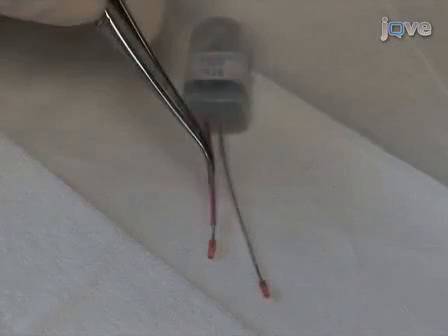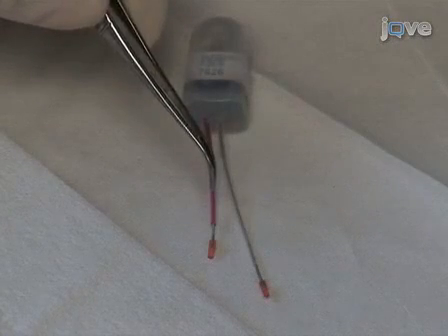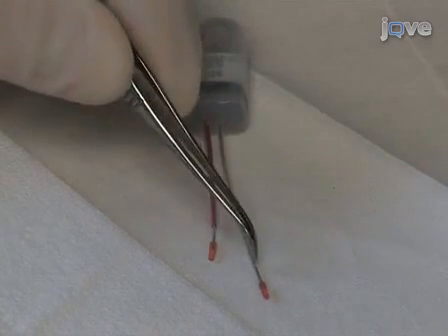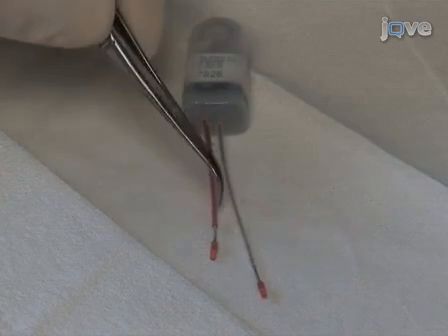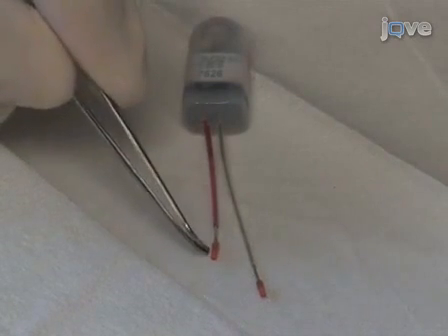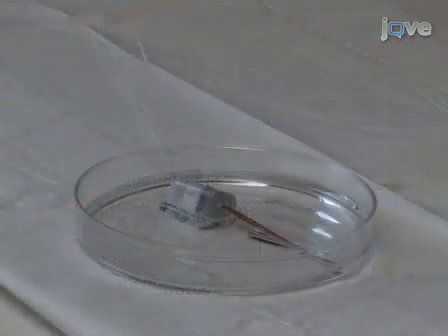Before inserting an ECG telemeter into the mouse, it is important to make sure the telemeter is sterile and in good working order. This is an example of a small animal telemeter from Data Sciences International with a red positive lead and a white negative lead. Each lead has an insulating sheath, 2 mm of exposed wire, and a plastic capped tip, which prevents erosion of the lead through the skin. New telemetry devices are typically provided in a sterile condition by the manufacturer, but telemeters can be reused provided they are cleaned using Turgazime 1% solution for over 4 hours.